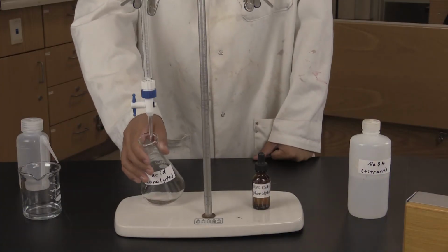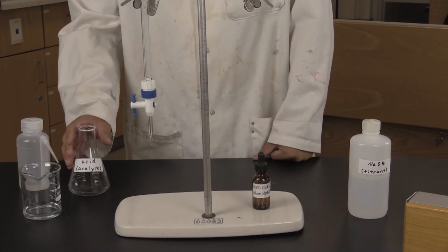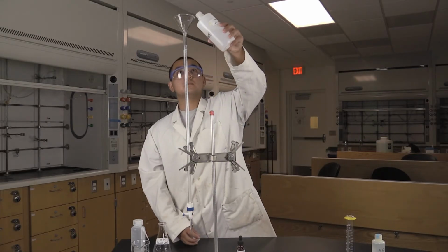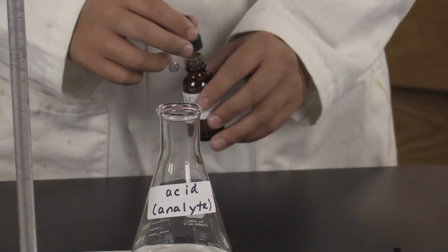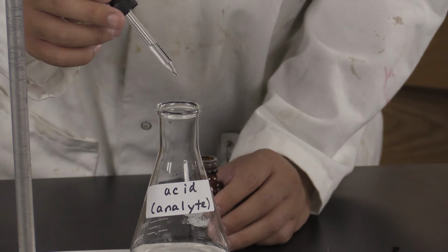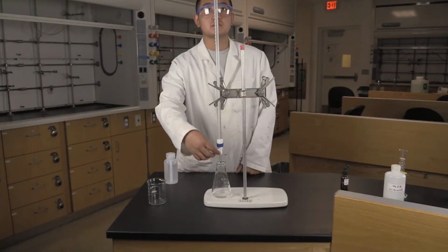Lloyd has already conditioned his burette, so he can go ahead and fill the burette with the titrant, sodium hydroxide. Don't forget to add the indicator solution, or else you will titrate forever and not know where the endpoint is. The indicator solution changes color to tell us when all of the analyte, hydrochloric acid, has been neutralized.